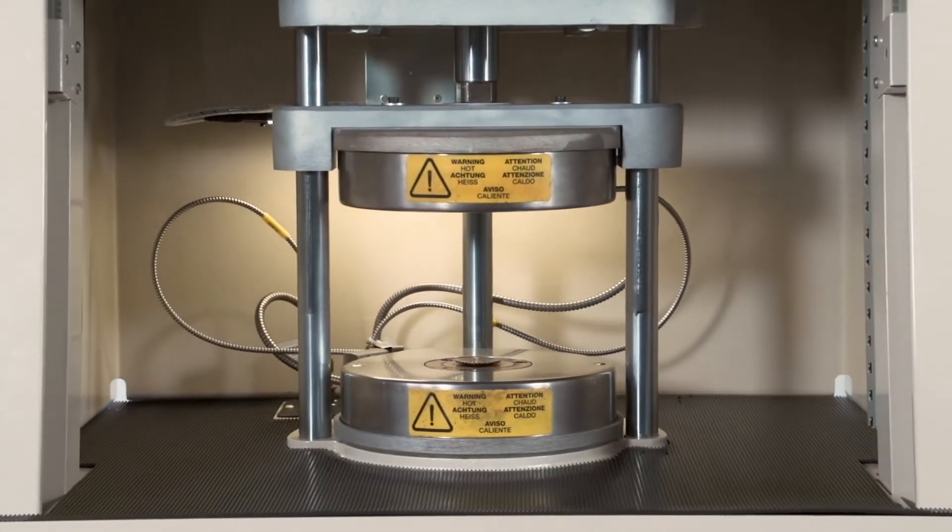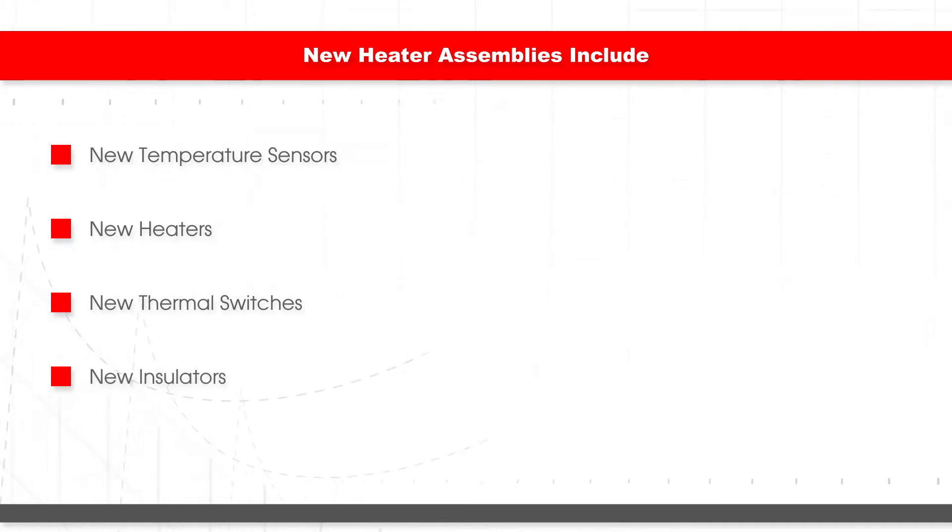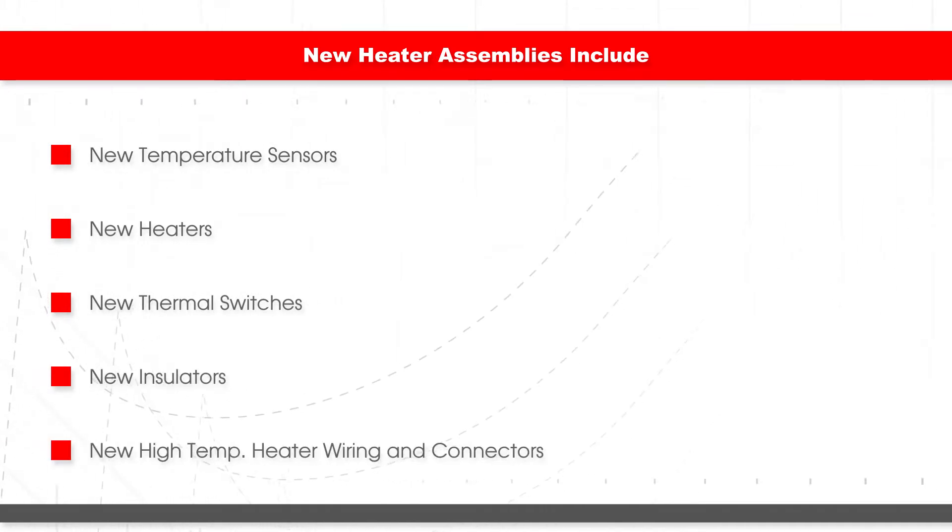Next, we install new heater assemblies in both the upper and lower platens. This includes new temperature sensors, heaters, thermal switches, insulators, high-temp heater wiring, and connectors.